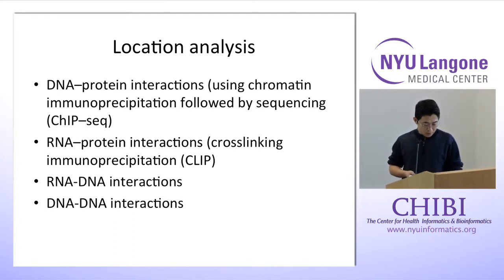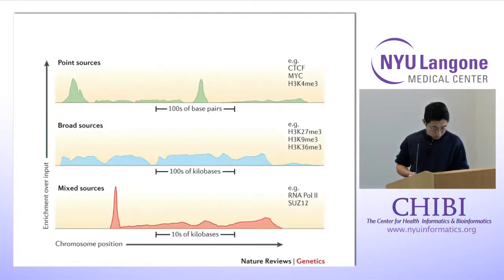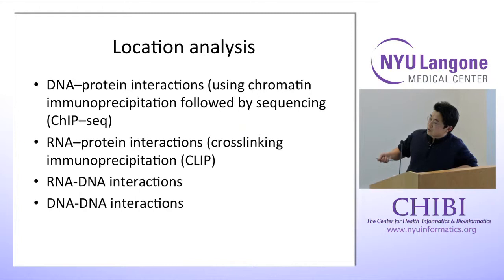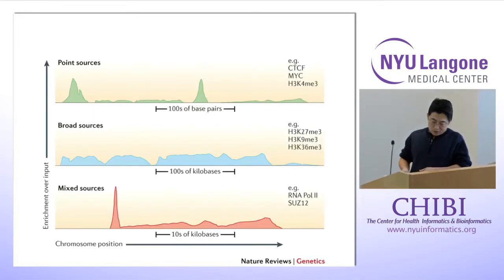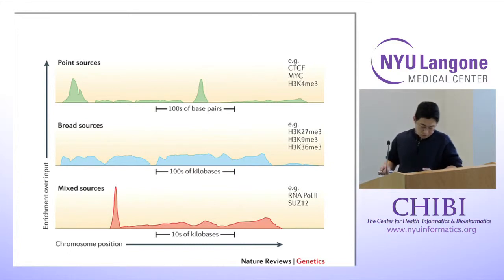That actually changes for different scenarios; it depends on the things you investigate. Here I will focus on ChIP-seq. For ChIP-seq, how many reads you need really depends on the factors. There are three types of factors, which they define as point source, broad source, and mixed sources.